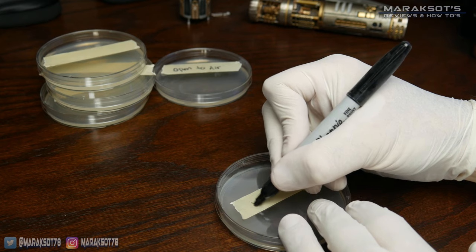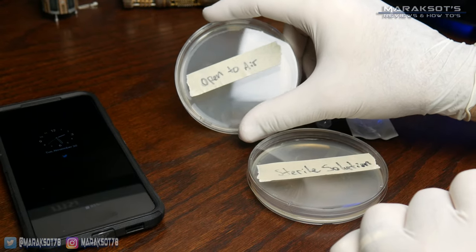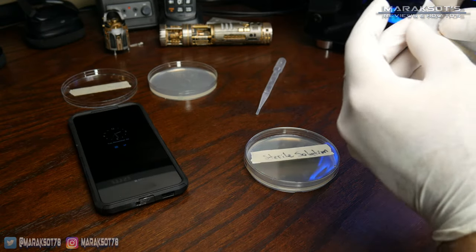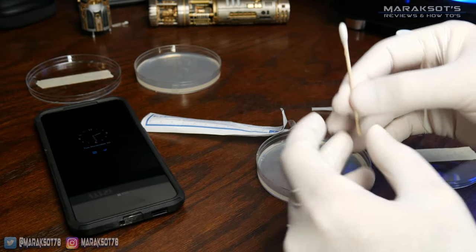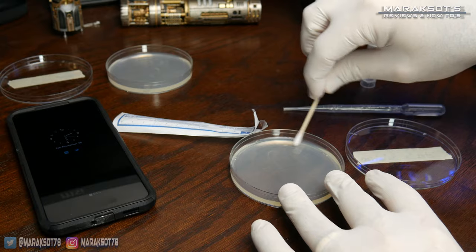I had five different samples I wanted to compare, so I first labeled all of my plates. The first two are kind of control plates. I took the lid off of one plate and just left it open to the air for a minute or so. The second, I used some of the sterile solution provided in the kit on a swab and swabbed the plate with that, just to verify the solution is in fact sterile.